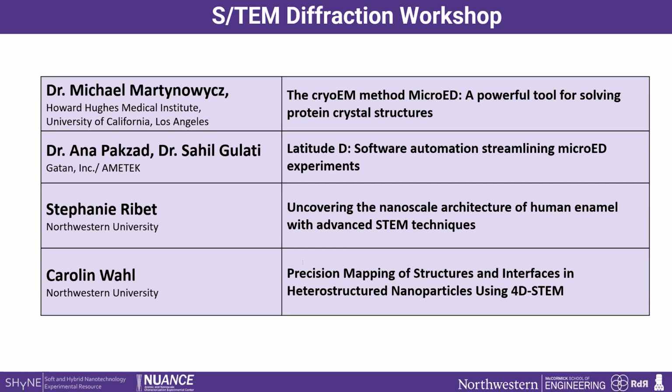Yeah, definitely. This is a good point, especially when you want to get information from reciprocal space, right? I think most of you in the audience have perhaps collected a diffraction pattern, right? So you usually use the center beam stopper, the so-called beam stopper, and then you might be able to see other diffraction spots that are a little bit farther from the center spot, right? That's basically because, depending on the dynamic range of your detector, you may or may not be able to see the center spot together with the higher scattering angle spots, right?